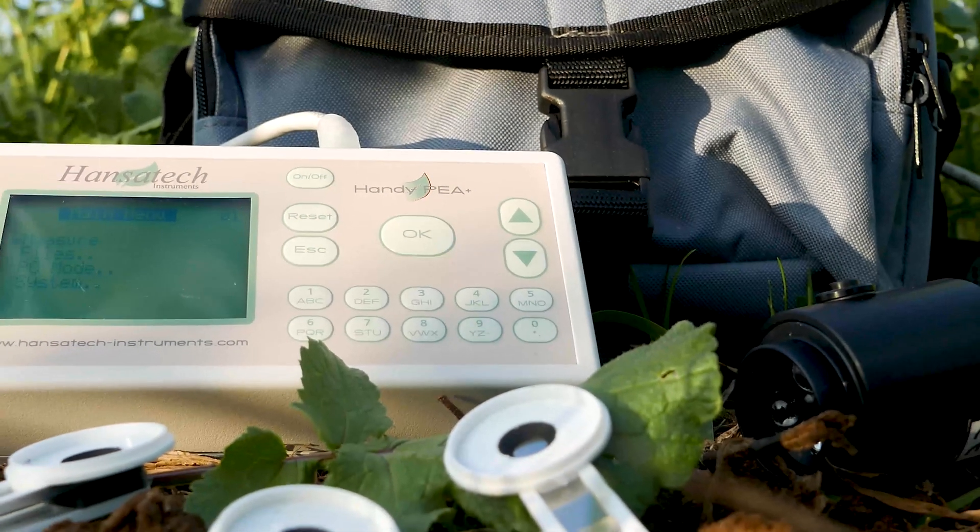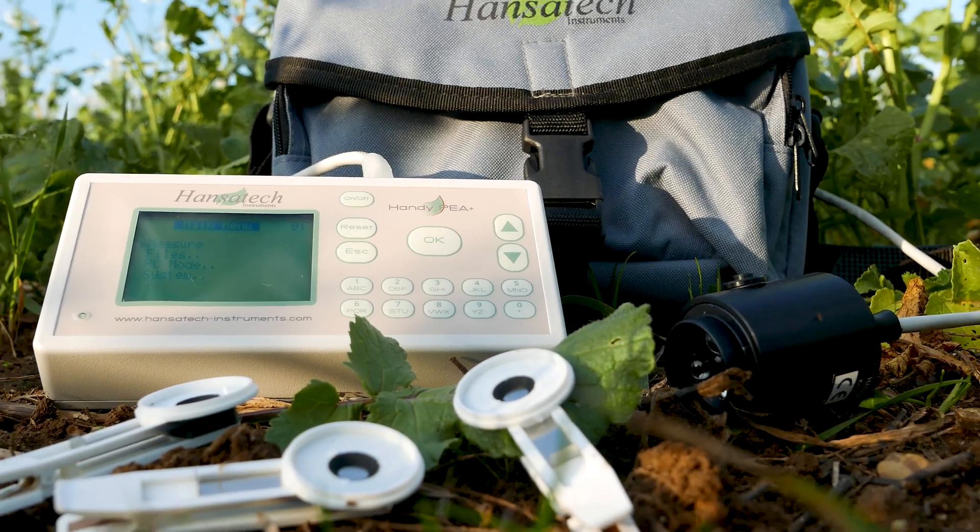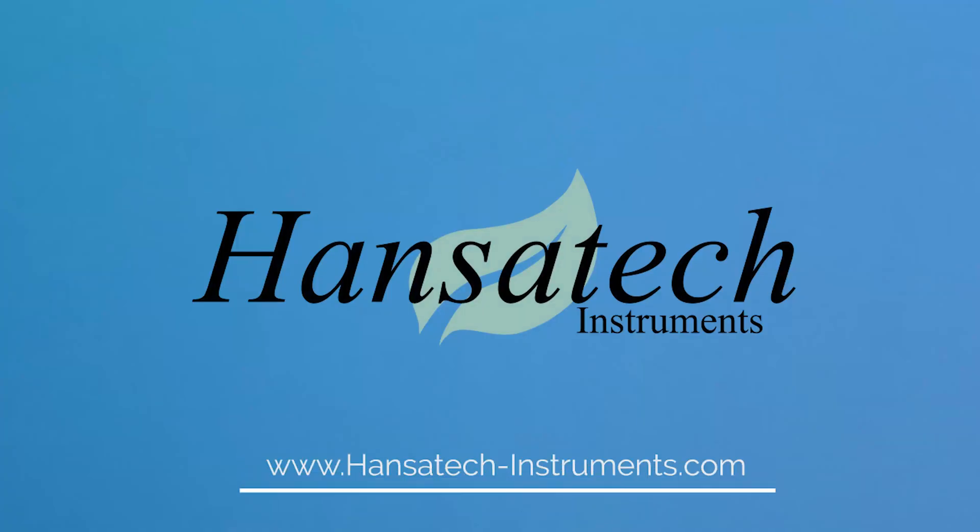For more information about this advanced continuous excitation fluorometer, please contact us or visit the Hansa Tech Instruments website.